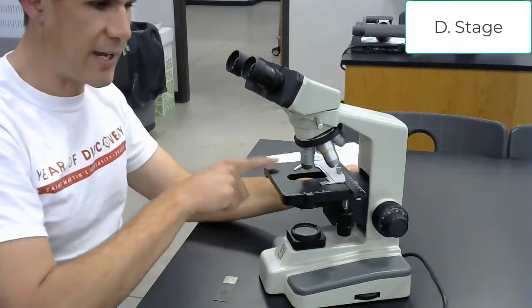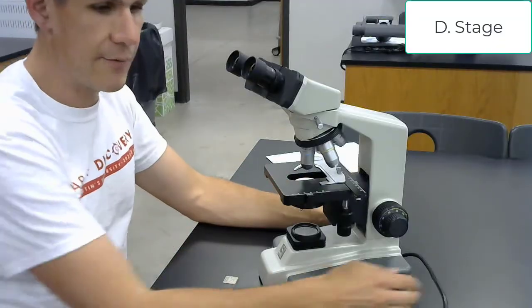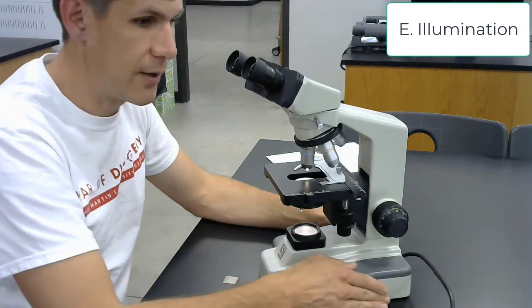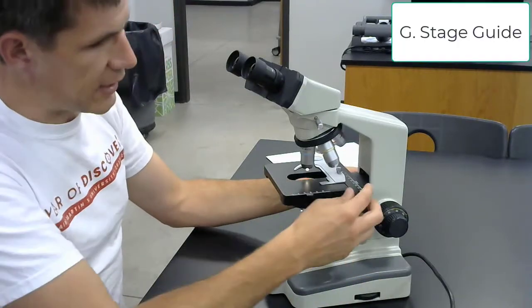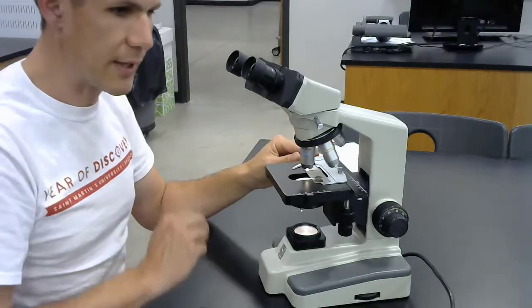Below this is the stage, which is this black surface right here, and the hole in the black surface gives rise to the illumination, which can be turned on and the light can be adjusted. We also see here the stage guide, which allows us to put a slide on and hold it in place.